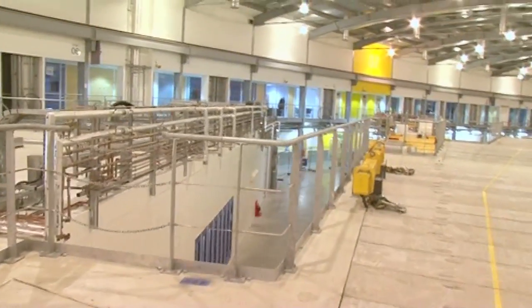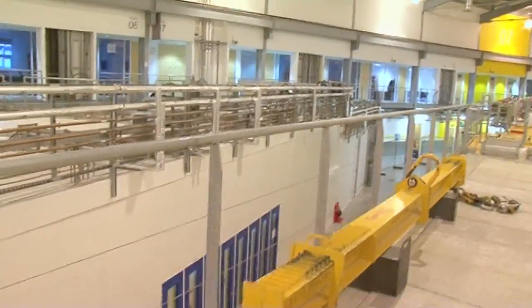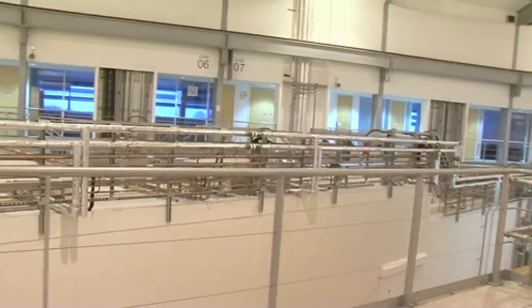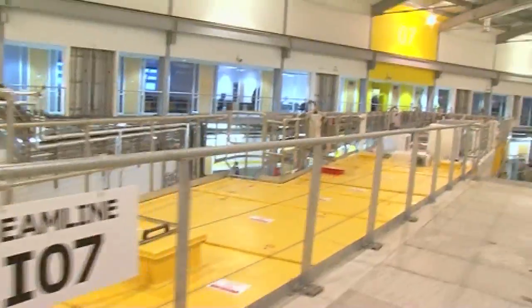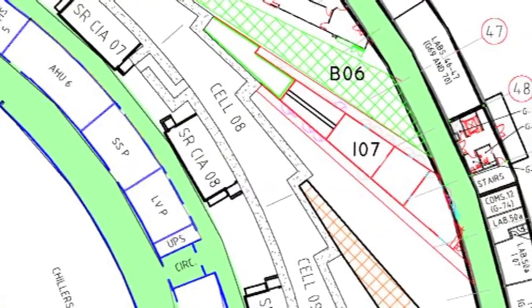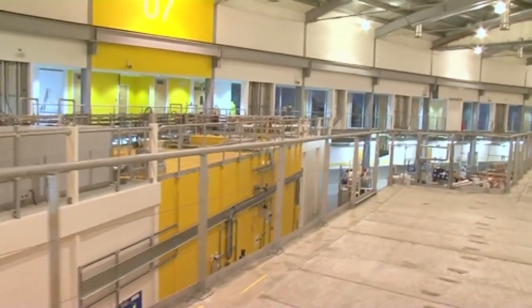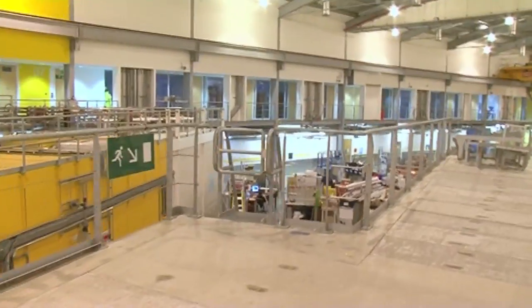We're just above IO6, a soft x-ray beamline where everything is done under high vacuum, and we're looking at electronic structures of materials. IO7, as we're now passing, is our surfaces and interfaces beamline. This is particularly useful for thin layers of materials, coatings or paints perhaps, but also looking at how things absorb onto interfaces — maybe a coating of some kind, or even looking at detergents. Lots of different types of applications.